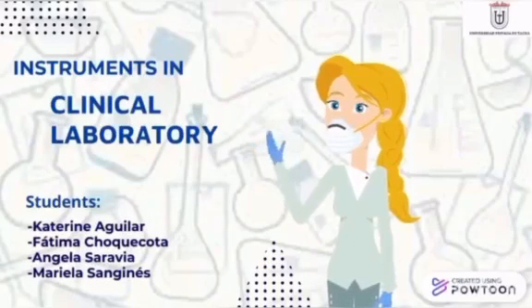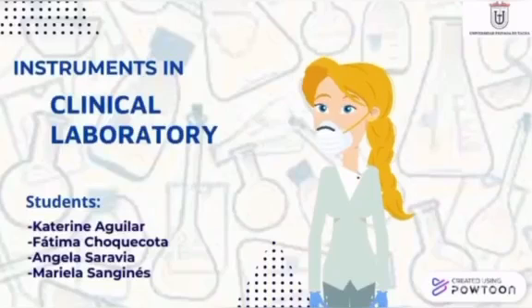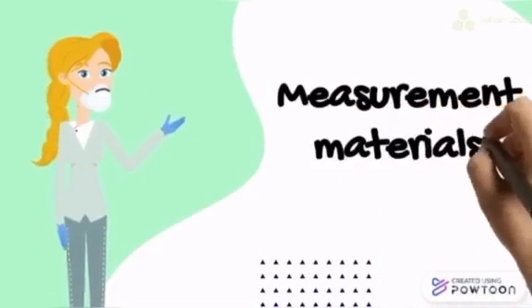Today we are talking about instruments in the clinical laboratory. There are a wide variety of instruments of different materials and functions. For example, measurement materials.